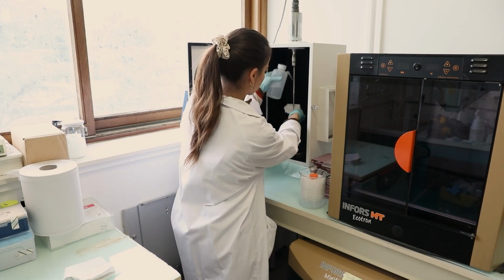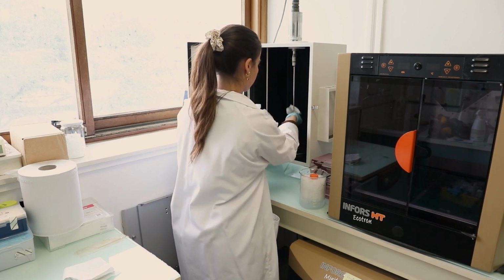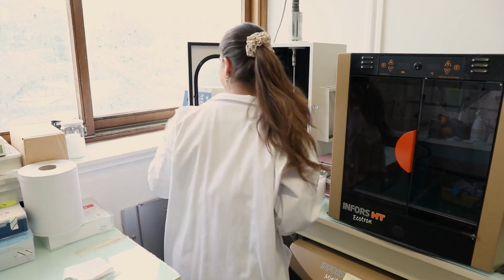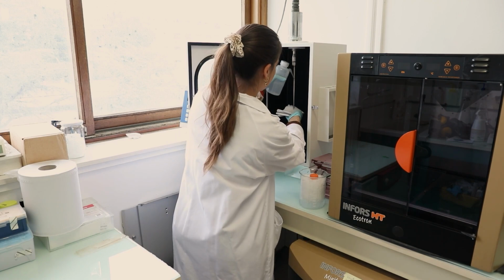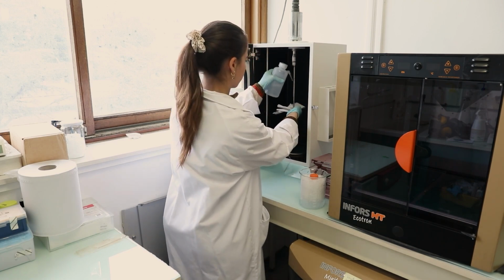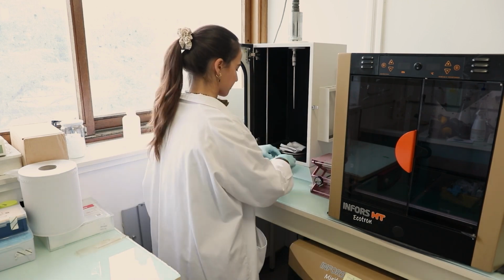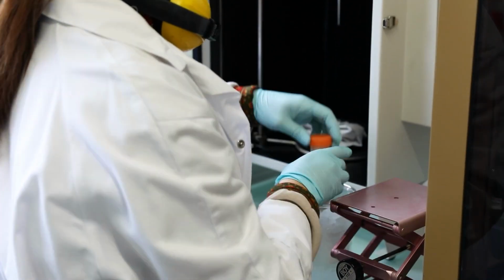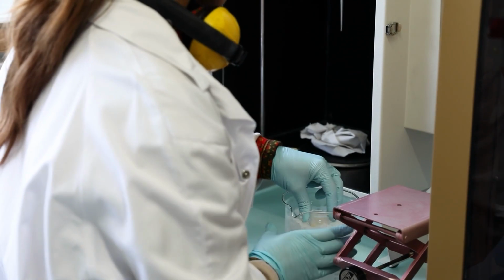First, we resuspend our cell pellet in a buffer that will ensure the stability of the recovered protein and allow for its subsequent purification through affinity chromatography. Resuspension is done by vortexing the cell pellets in the buffer until the solution becomes homogeneous. As proteins may be unstable at room temperature, all subsequent steps of the purification are performed at 4 degrees Celsius or on ice. Once the pellet is resuspended, we lyse the cells with a sonicator.